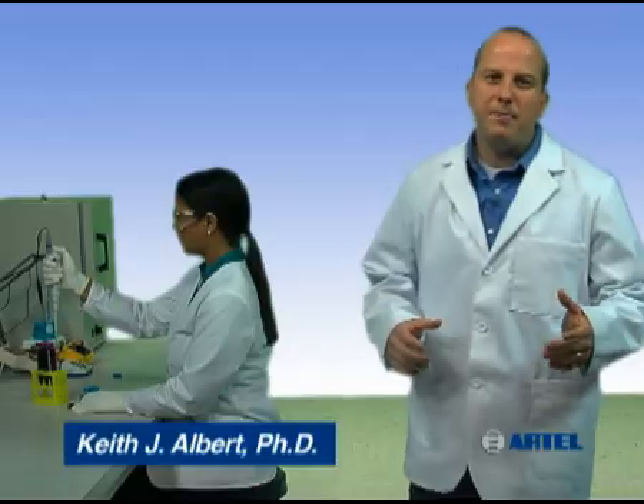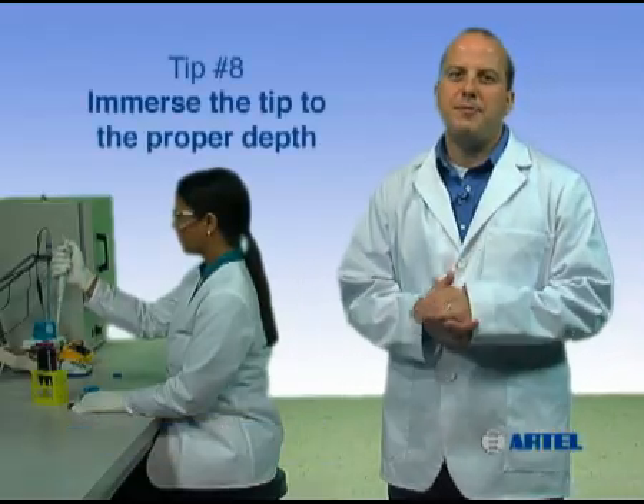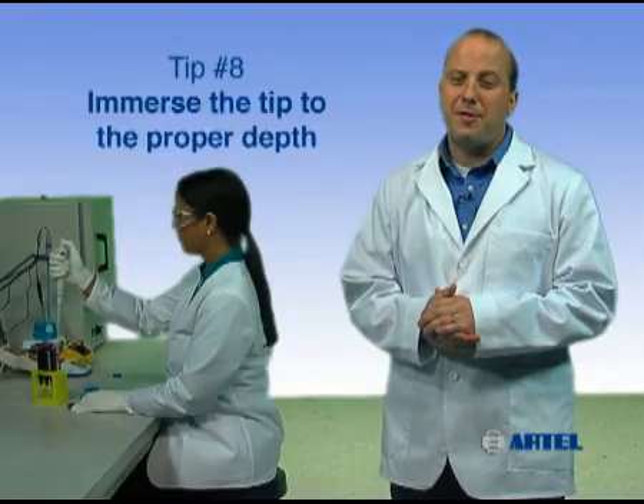By using proper pipetting technique, you can build confidence in your work so you can trust your results. Pipetting tip number eight: immerse the tip to the proper depth.